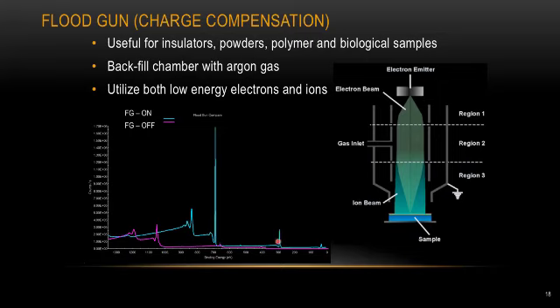So you can see once we have some charging issue happening on our sample surface, the peak has been shifting by a couple of hundred eV in this case. And also for each peak, the peak has been broadening quite a lot, and that will also degrade the chemical specificity. So that's why for this kind of magenta spectrum, it's very hard for us to determine any elemental information and any chemical information. So the charge compensation is pretty critical for any sample that doesn't conduct well.